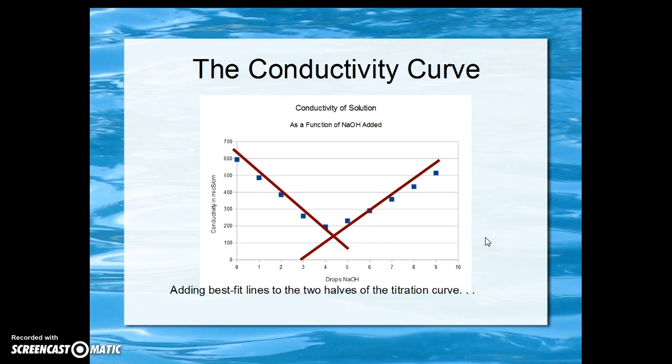Best fit lines added to the two halves of the titration curve show in fact that we have two linear functions that are colliding here around four and a half drops of sodium hydroxide.